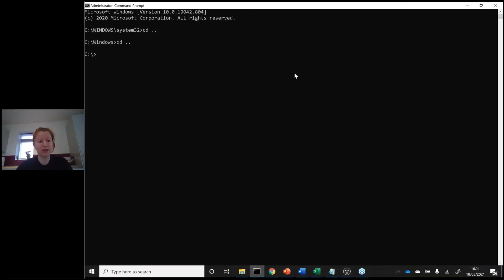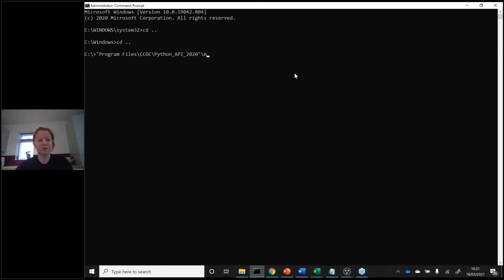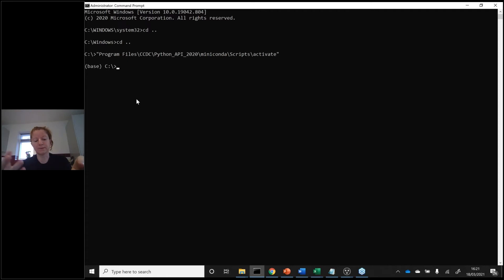In Windows, once you open the terminal, you'll have to activate your Miniconda environment so you use our Miniconda Python. To do that, type Program Files where your CCDC install is, then Python API, then Miniconda, then scripts, then activate. Hit return and you can see now you're in the base Miniconda environment.